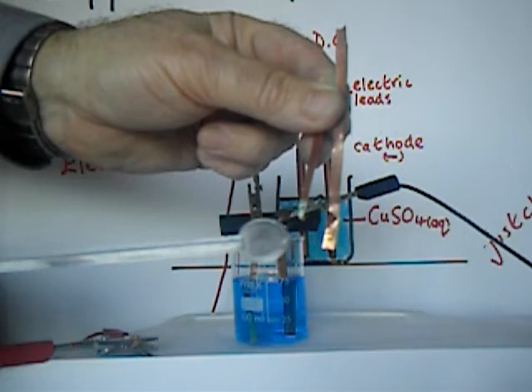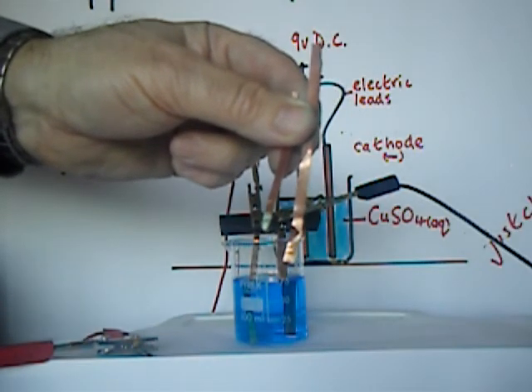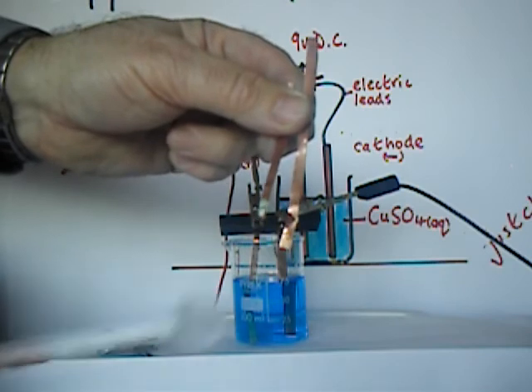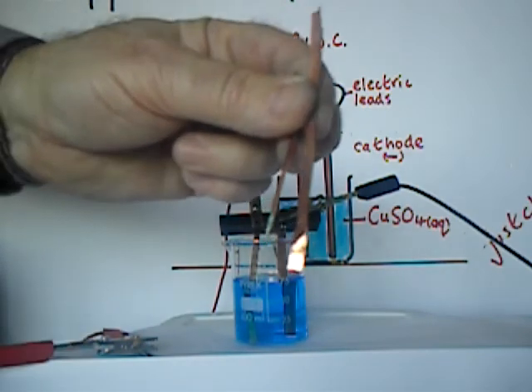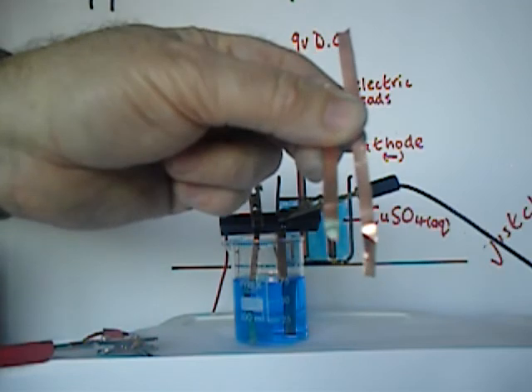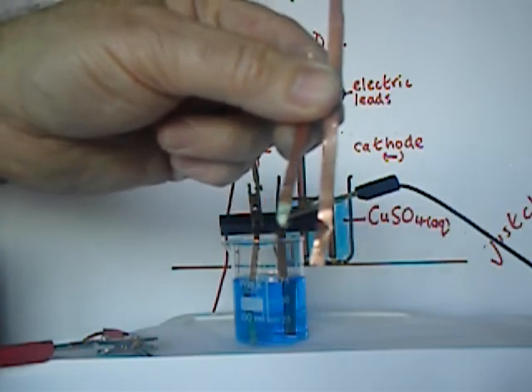It won't be clear. But this here has thickened up the right-hand electrode, the negative electrode, the cathode. Copper has deposited and it has got heavier. I think you can see that perhaps it has got shinier. And you can indeed see what looks like pure copper has been deposited there.